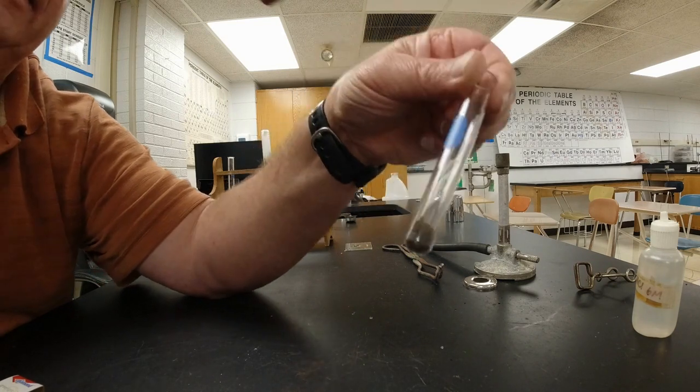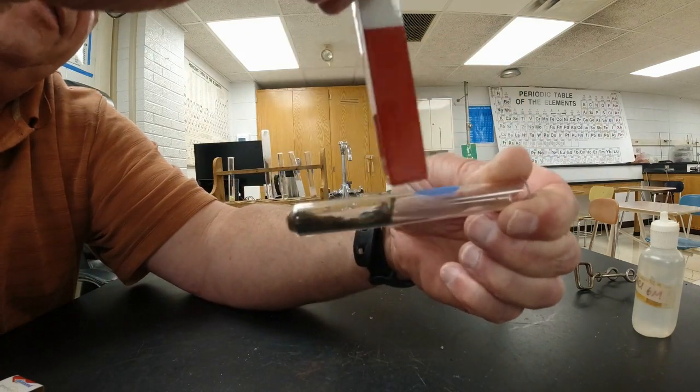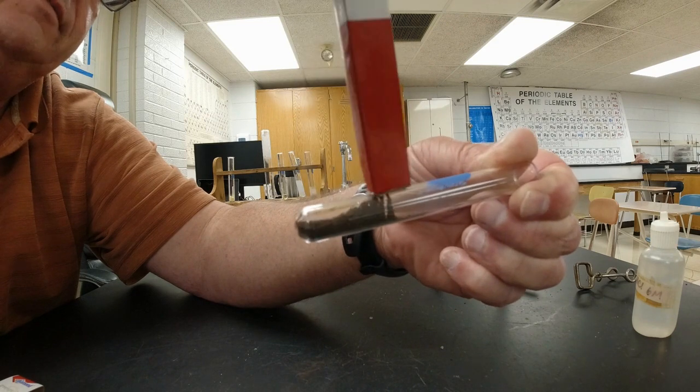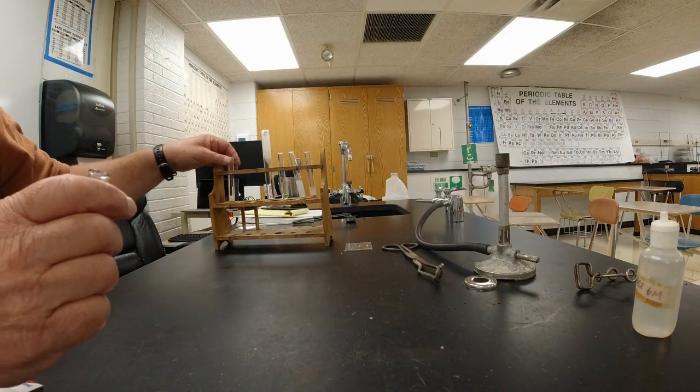So let's look at this thing and see what happens when I put a magnet next to it. You can kind of see that I can actually drag the iron around. It's attracted through the glass to the magnet. All right, now let's mix these two together.